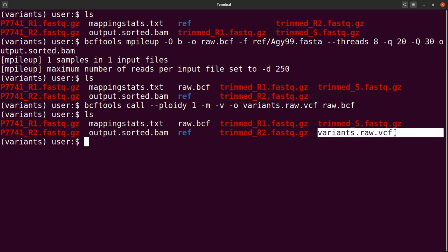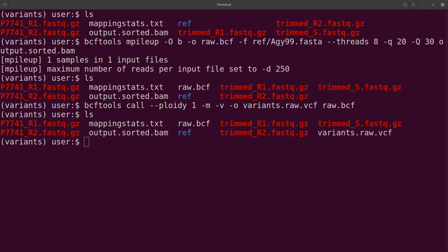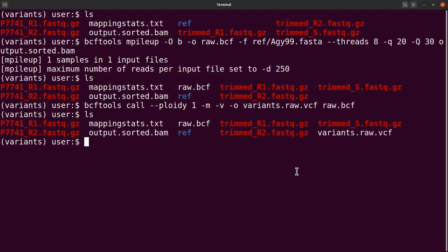Now, once you have this VCF file, then it's time for what I call the post-VCF, where we handle the VCF file, manipulate it, get some information and do some analysis. So that is the exploration stage. Here I'll just take you through a few of them, and you can check my playlists on the handling of VCF files, where I cover tutorials on what to do after calling the variants to generate your VCF file. Just check that out. I will leave that playlist at the end of this video. So let's do the exploration.